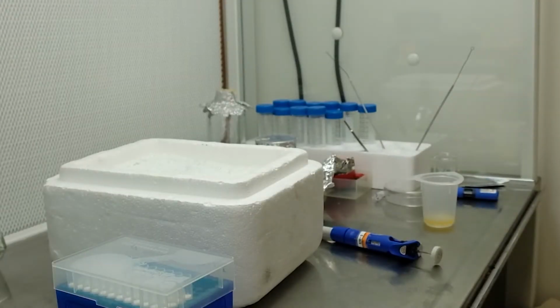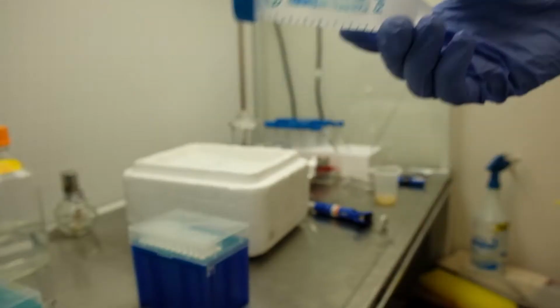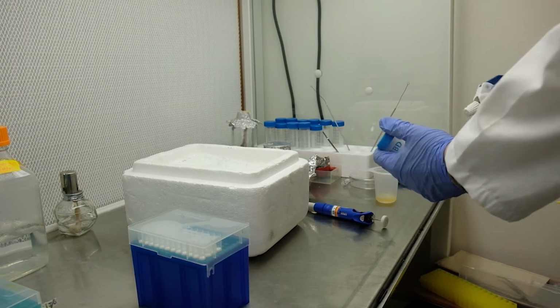As our competent cells will be stored at -80, we need to resuspend them in 15% glycerol in addition to calcium chloride.